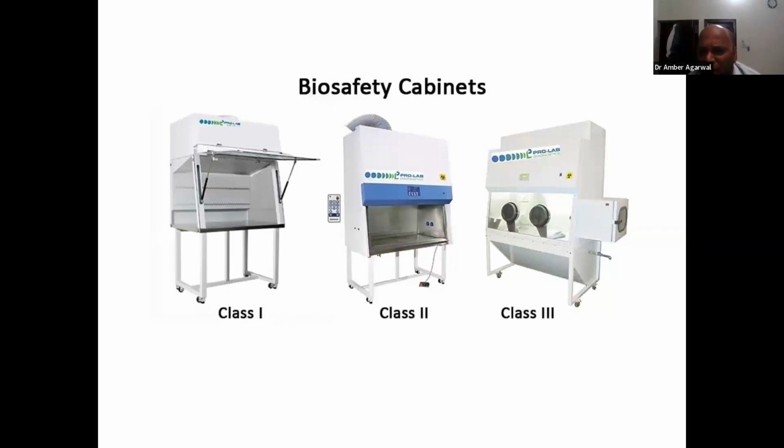I guess everyone has worked in a biosafety cabinet. In our college also biosafety cabinets were there, but not functional. So if you see the class 3 biosafety cabinet, it is fully enclosed, you see the gloves in between, in the two figures, in which the hands have to be put and worked upon. Class 2 biosafety cabinets are generally available everywhere.